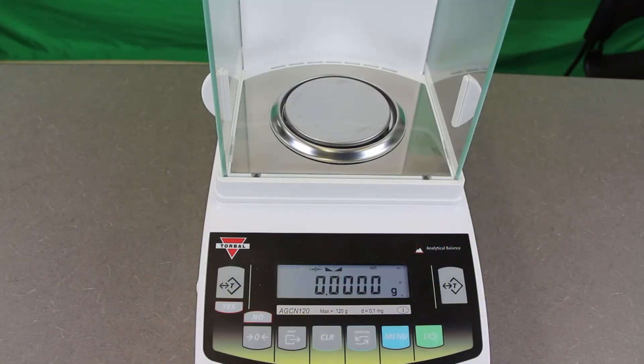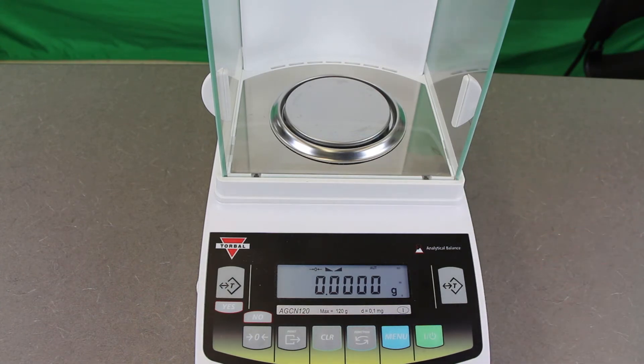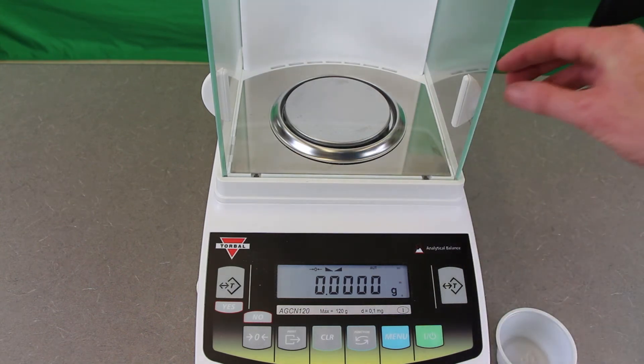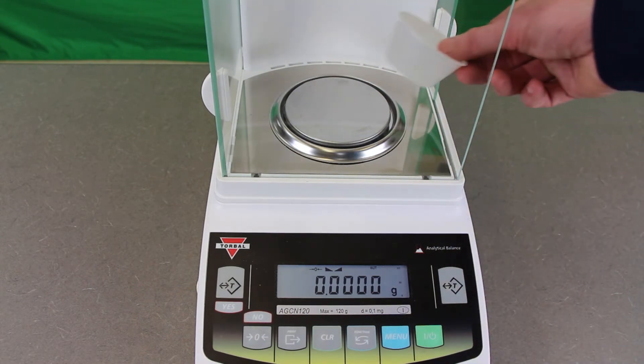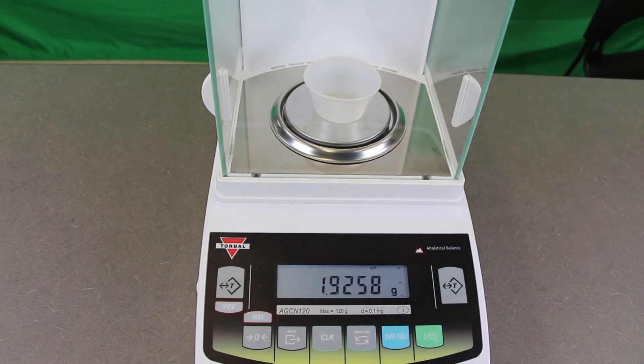Now that it's calibrated, you're going to want to get some sort of sample container and put it inside the device in order to tare out, or zero out, the weight of the sample container. Simply open up the side to access the inside, place the sample cup on top of the scale, give it a moment, and hit the T button — the tare — and that zeroes it out. Now the weight of that sample cup is equal to zero on this scale.